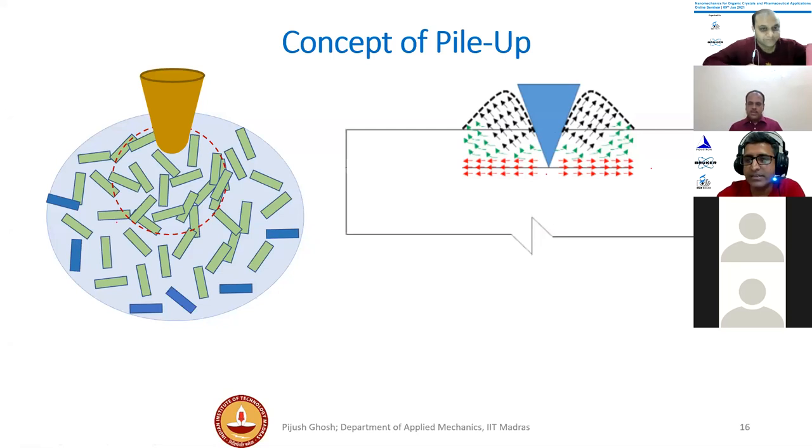Yeah, so that is very tricky, in the lattice. Right. It depends on how volatile it is, because every indentation takes a certain time. And if the solvent is volatile within that time, then you may not be able to capture that. So that is a little tricky, and you have to actually work with your system and see how much loss of the solvent is happening and in what time.